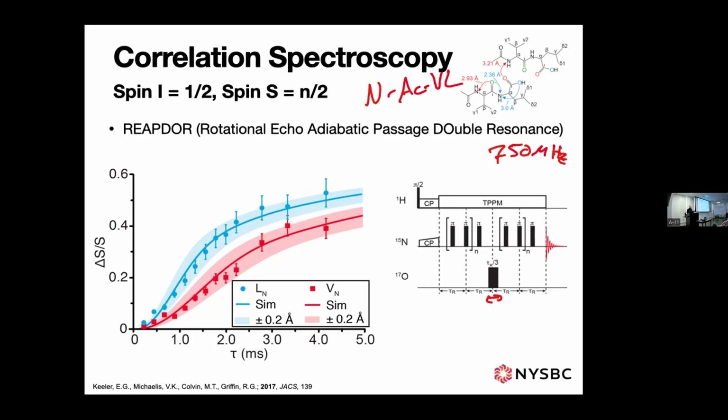That's the only thing that's happening on the quadrupolar nucleus. Everything is just regular nitrogen detected. And then we can detect these buildups and we can fit them to distances just like we would anything else. Here, each curve has to be simulated using 2 distances. It's kind of hard to see, but the blue curve is these 2, and I'll change colors, the red curve is that one to those nitrogens here and here.